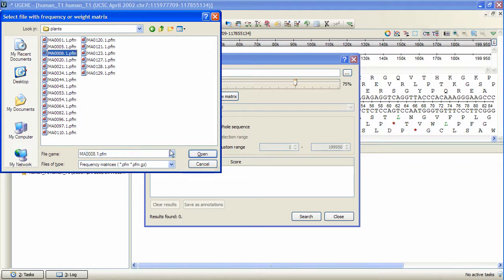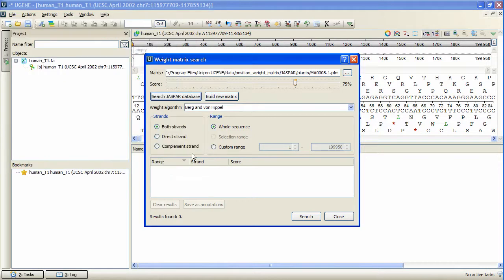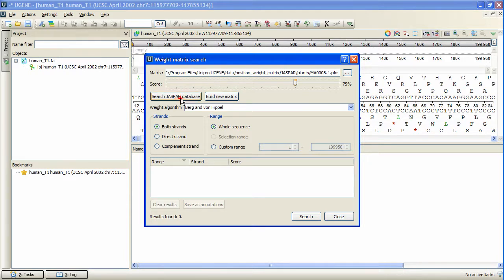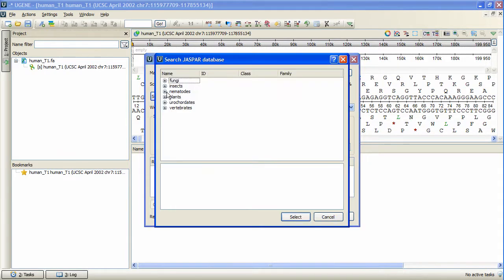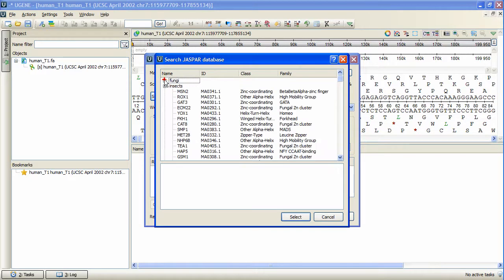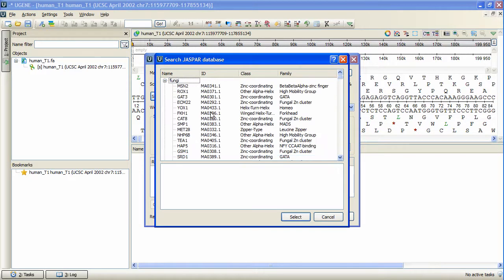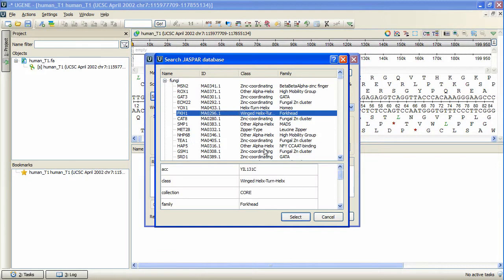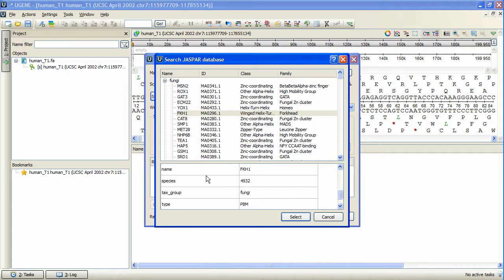Also, it is possible to search the JASPAR database with the special interface by pressing Search JASPAR database. Here the matrices are divided into categories, and we can read detailed information of every matrix represented by the properties.